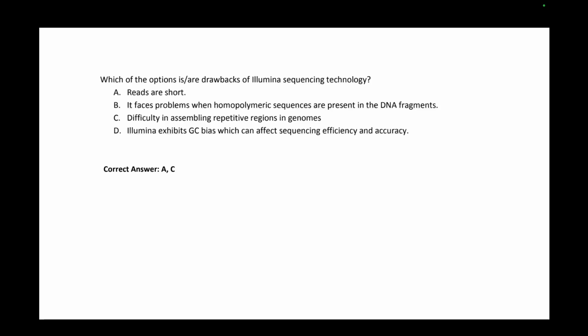So if you have a read of 150 base pair length along this 2000 base pairs, where will you align the 150 base pairs? Because everything is repeat. So for repeats, this short read becomes an issue because in most cases the length of the repeats far exceeds the length of the reads that you are getting from short read data. So that is a major issue with Illumina as well. This is a major thing that we face if you want to study big duplications inside the genome. One such example is Huntington disease.